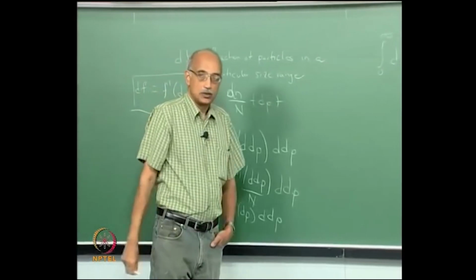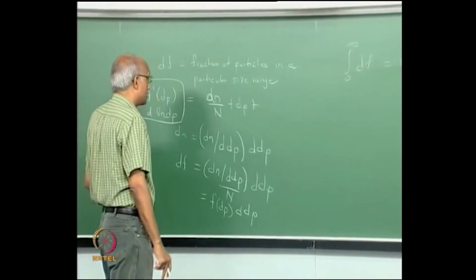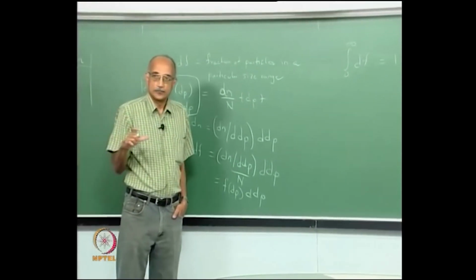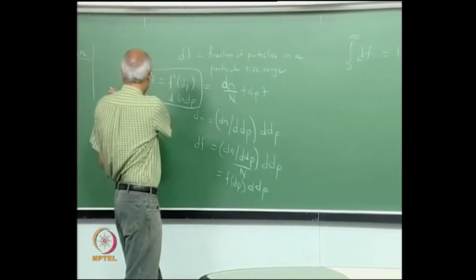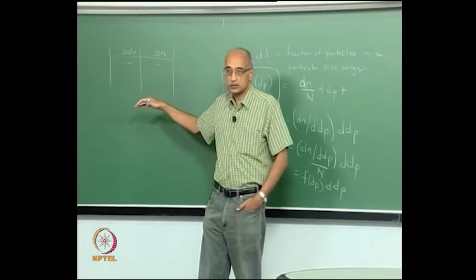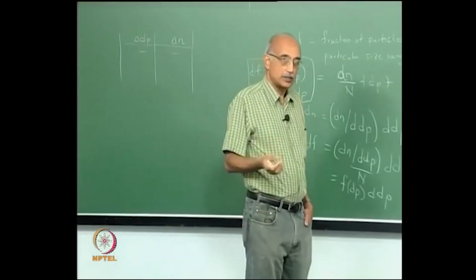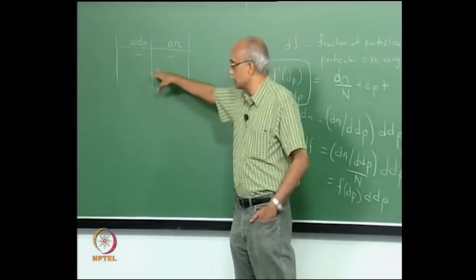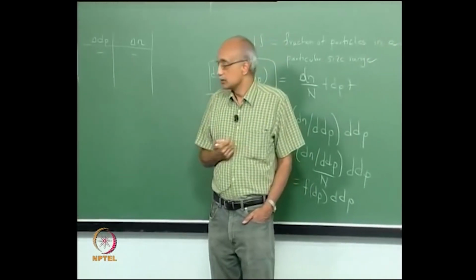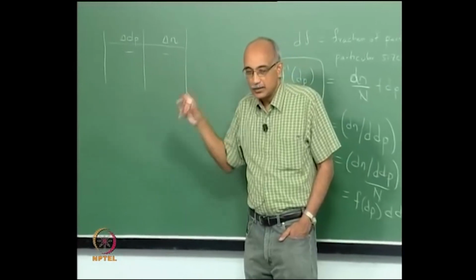Now, suppose you want to know all particles that are, let us say, between sizes a and b. Now, in a differential table it is very easy to do. You essentially just take those two numbers and count all particles between them, but obviously you can imagine the difficulty that the sizes here may not correspond with the interval you are looking for, right. So, depending on the granularity of your channels you may not get the information you are looking for.